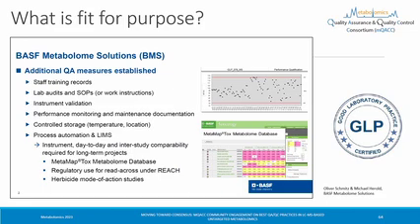A third kind of example here is BASF Metabolome Solutions. They, I think, similarly have these types of investments across the board. Here, they're good laboratory practice certified, right? So these certifications start to become important, especially if you're providing services. If someone is going to come back to you and say, I trusted you with my samples, I trusted you with my precious materials, and I want to know exactly what happened, now you're working to a different level of accountability. Not necessarily a different level of quality, but a different level of accountability. So the assurance of quality in your organization has to be slightly different.